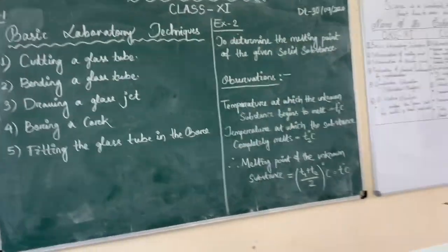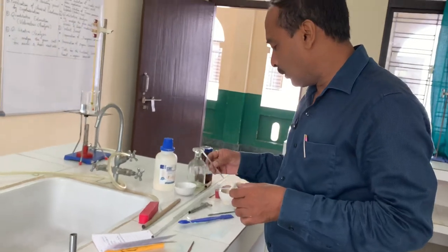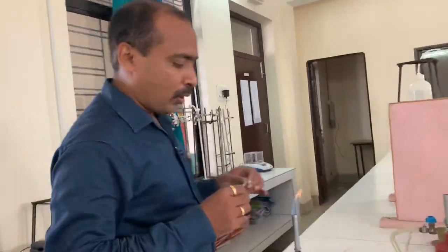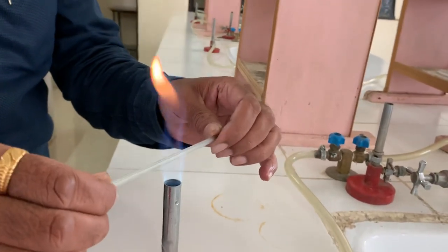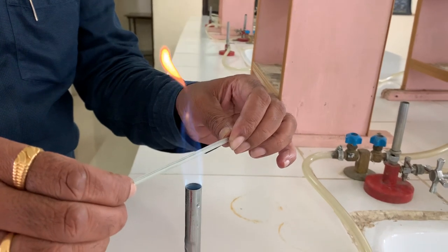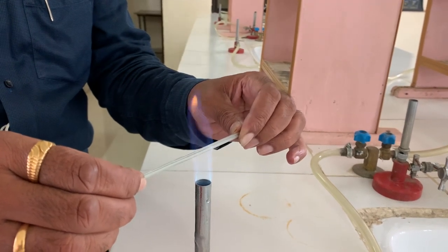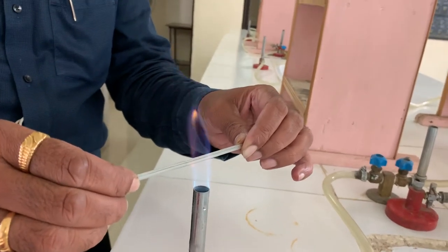Next is drawing a jet. How to prepare a jet — jet means nozzle. Again, you take the glass tube to the flame. What you will do is move it, then pull — pulling the hand in the opposite direction. You pull both hands in opposite directions. After melting, it will be making the jet shape.